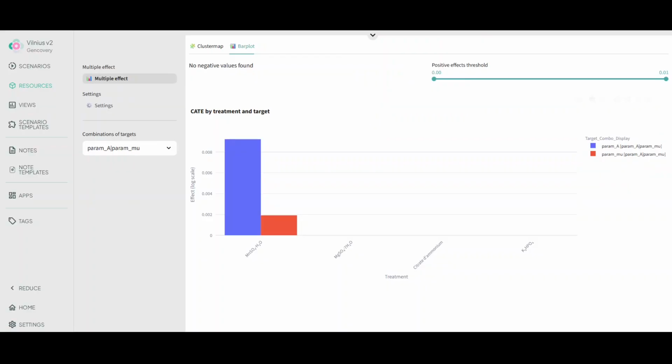This illustrates an important lesson. Causal inference is only as good as the experimental design supports. When two factors always change together, you cannot estimate their individual causal effect from observational data alone. Enriching the design, for example, adding a medium with high dipotassium phosphate, low magnesium sulfate and low citrate, would allow the causal algorithm to disentangle this effect.